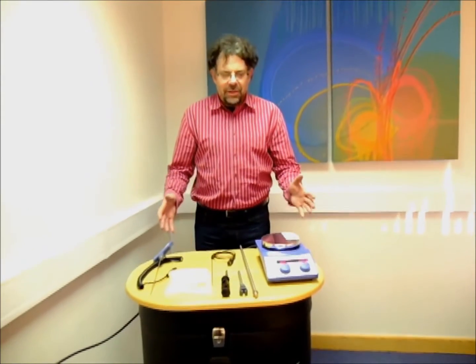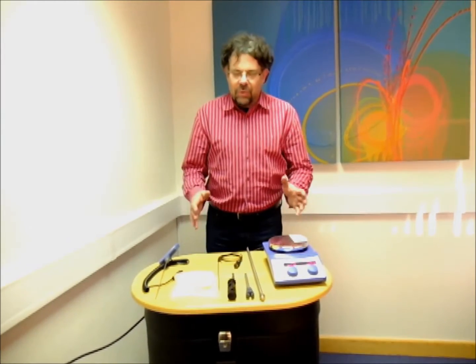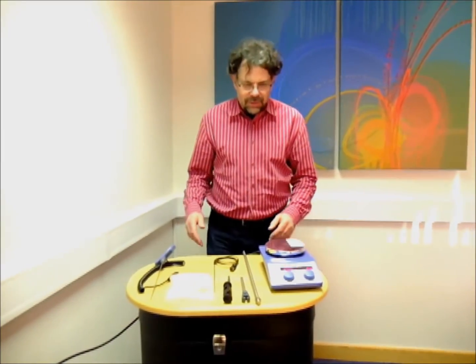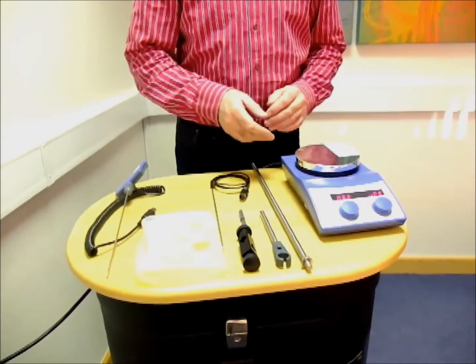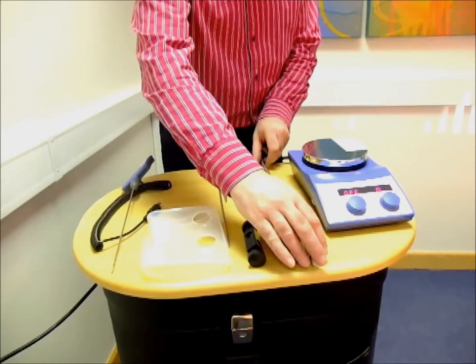Hi, I'd like to show you the Async hot plate stirrer package that's available to our customers and what's incorporated and some of the features and qualities of this package. So here we have our safety control hot plate stirrer with two independent temperature circuits and some of the other components that come with it. Let's go through those first.